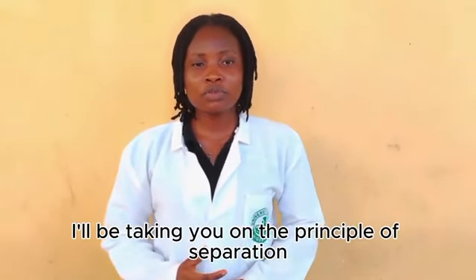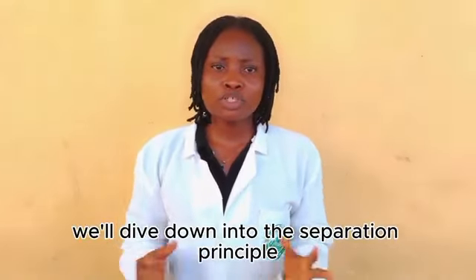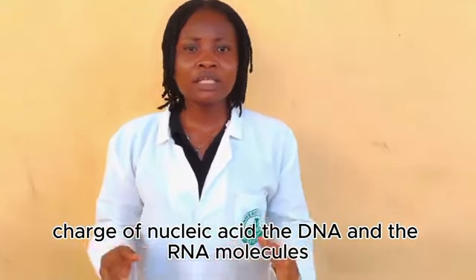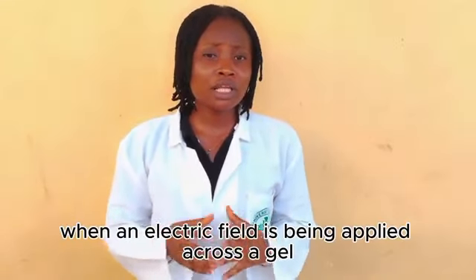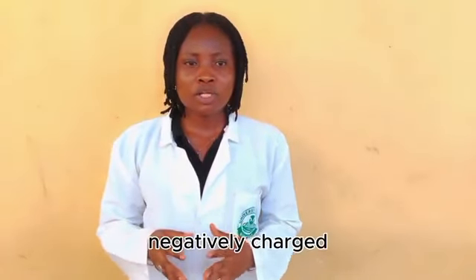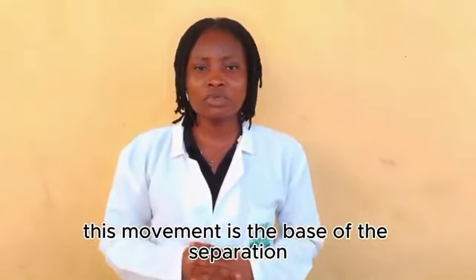Hello everyone, I'm Elizabeth Moses. I'll be taking you through the principle of separation of agarose gel electrophoresis. Having been told what agarose gel electrophoresis is, we'll dive into the separation principle. Principle number 1, charge of nucleic acid. DNA and RNA molecules carry a net negative charge due to their phosphate backbone. That is, when an electric field is applied across a gel, the negatively charged nucleic acid moves from the negative electrode towards the positive electrode. This movement is the basis of the separation.